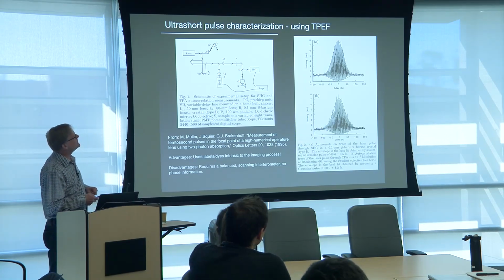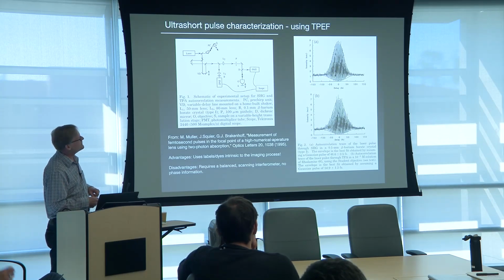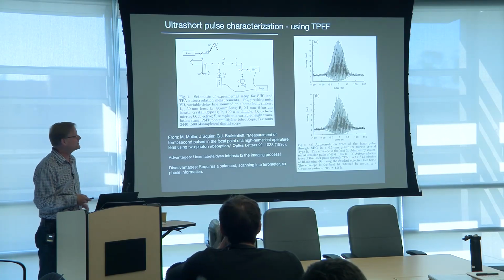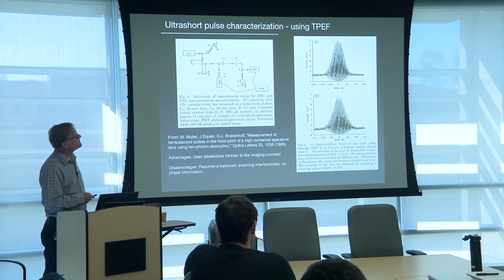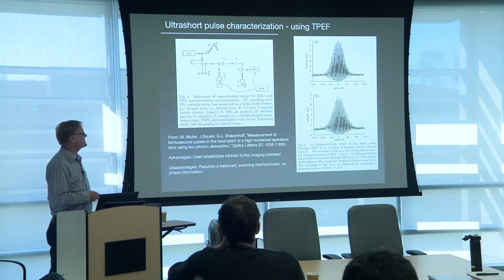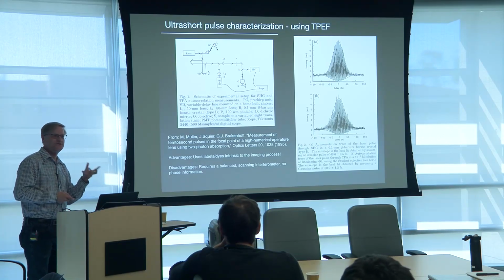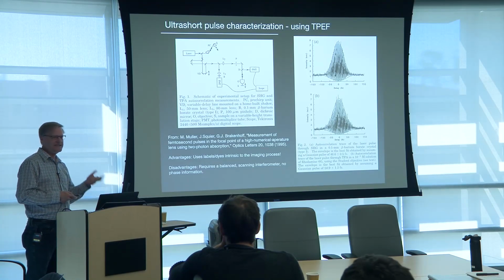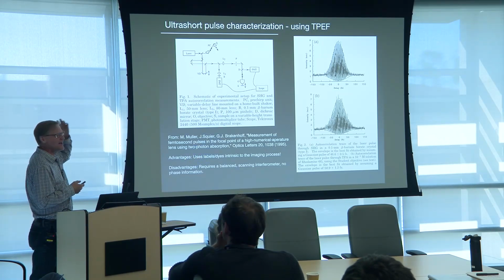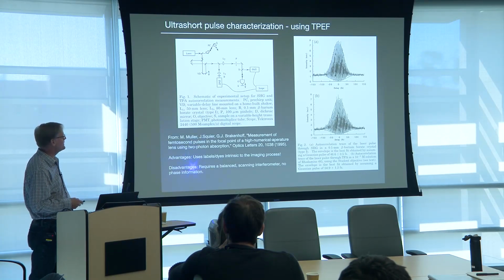Here I think you can already pick out those. So first we did it, so this one was with a doubling crystal. And here we're doing it with a dye, and you can already see a kind of a distinct shape difference between those. These are pretty short. These are around 50 femtoseconds. So in all these I've tried to give a couple of, so the advantage of this technique, it uses dyes that you already know work, so you can just take advantage. So you could do autocorrelation at any point in the brain of your animal if you want to. And then you can actually shift these off of one another spatially. You can measure your beam focus spatially as well.